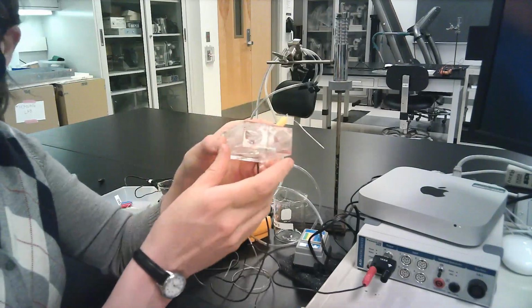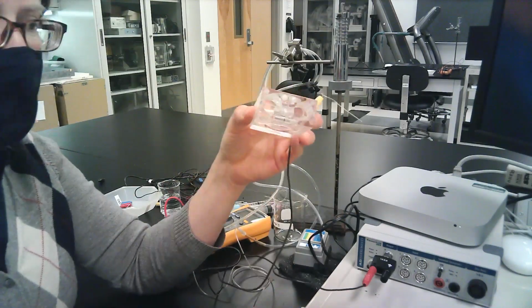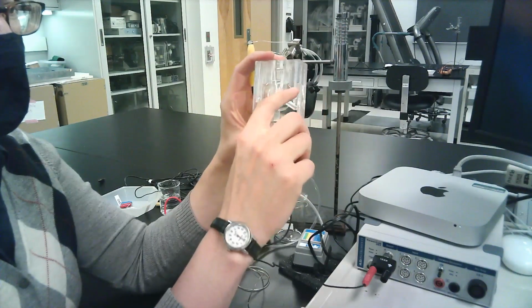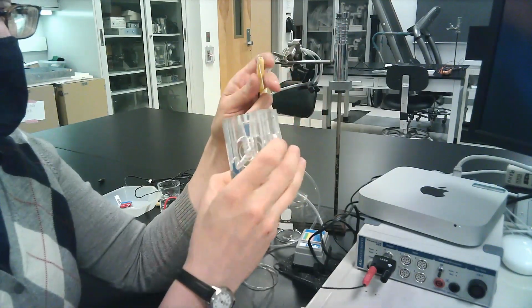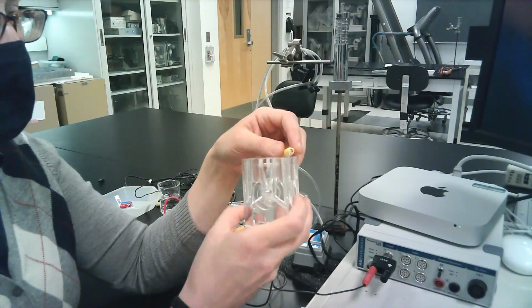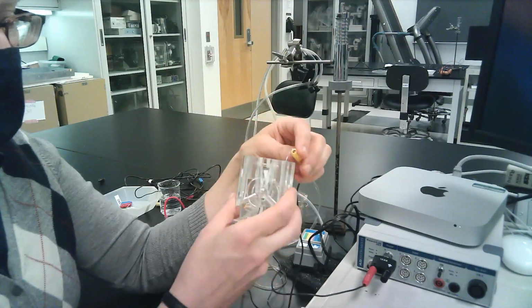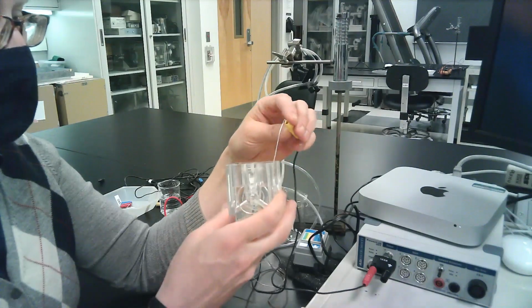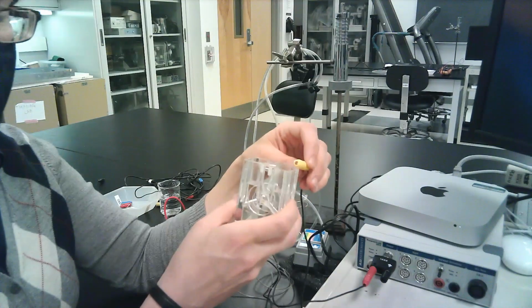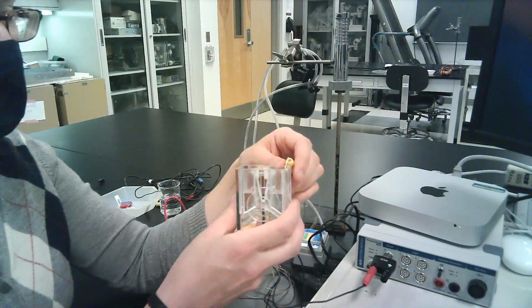And inside of this chamber, there's a set of wells that run fairly deep. You can kind of see them on the side. So you can put your stimulating electrode there into the side or into a separate back well as well. So you just want to make sure that it's in there in a place where it's secure. It's not going to flop around too much.